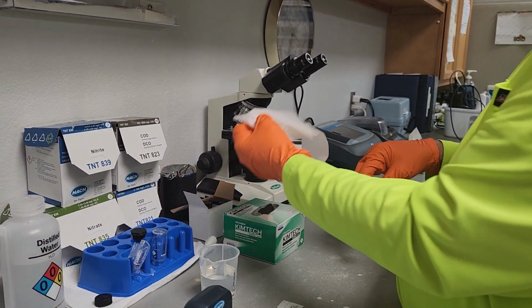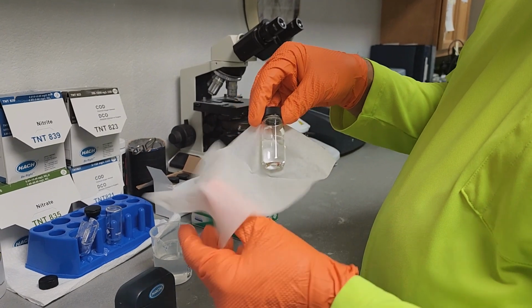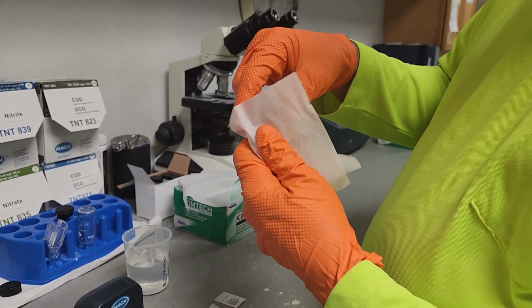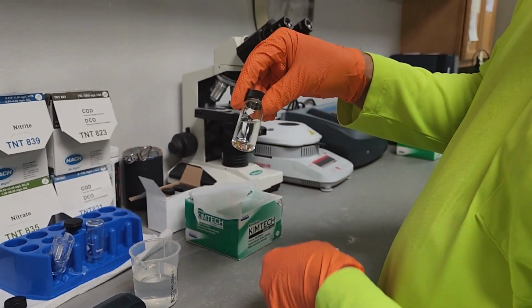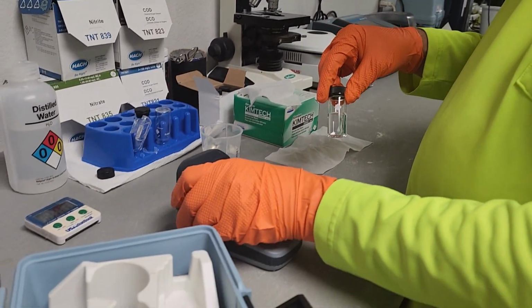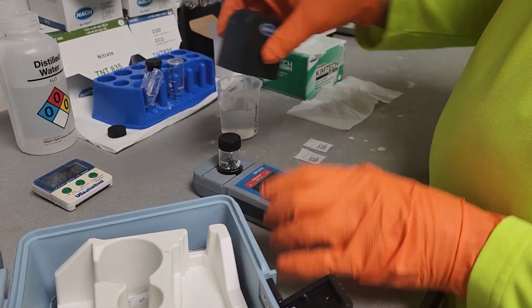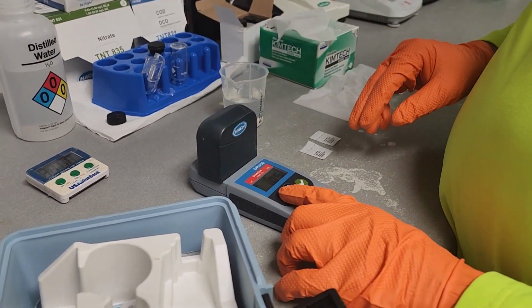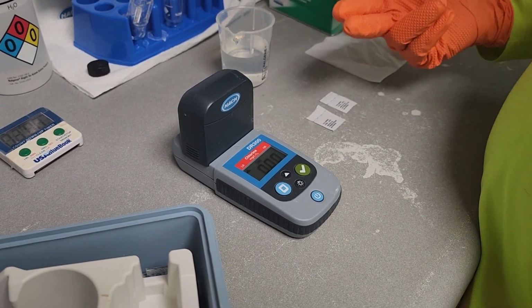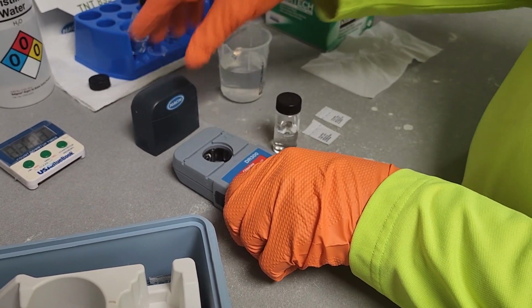Now I'm going to take some laboratory tissue. This tissue will not scratch the plastic or glass sample cell. And it's good to have an extra supply of these sample cells around because they do get scratched after a while. So I'm going to set that in there, and I'm going to calibrate this sample. So it's going to come up all 0. Okay. Take this off, take this out.